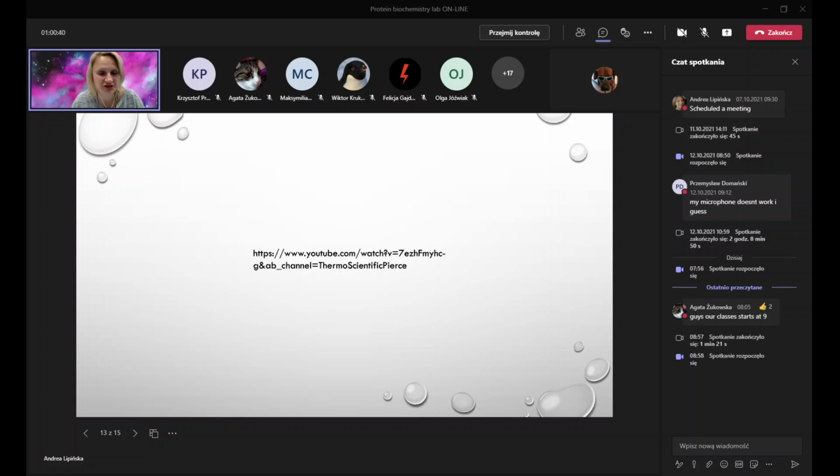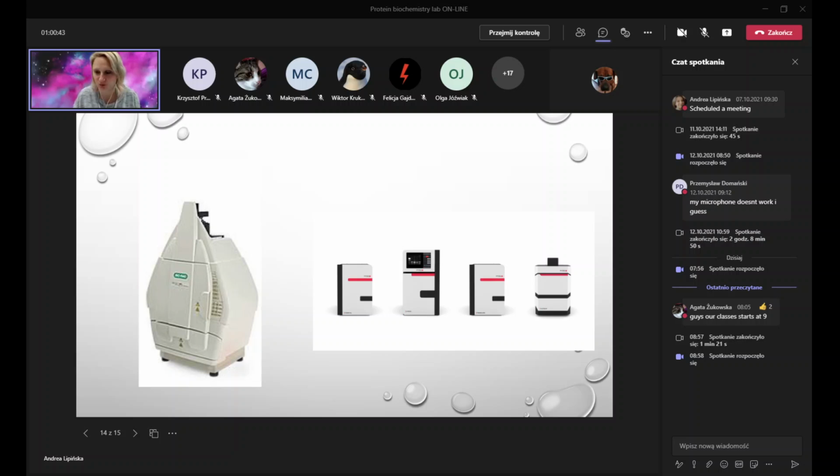And the question is when we are deciding that we want to use wet or semi-dry. And the answer is generally that it depends on time, usually. So semi-dry blotting is much faster, because now if you're using commercial reagents, you can do it in 7 minutes. That's at least what the company promises. But usually we don't go beyond 1 hour, even with big membranes.